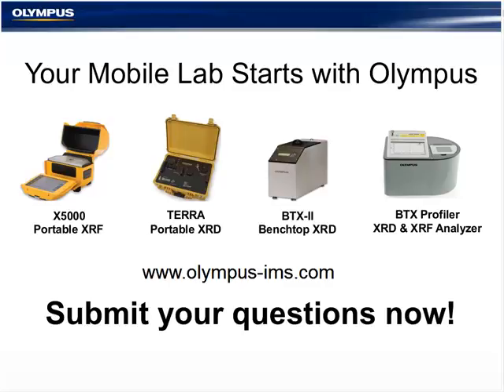With the Terra, you absolutely have to get the particle size down to less than 150 microns in order to enter. But luckily, I haven't met a rock yet that won't get down to that size. And once you've got a nice dry powder and great homogenization, you really are set up to have a beautiful diffractogram through the Terra.